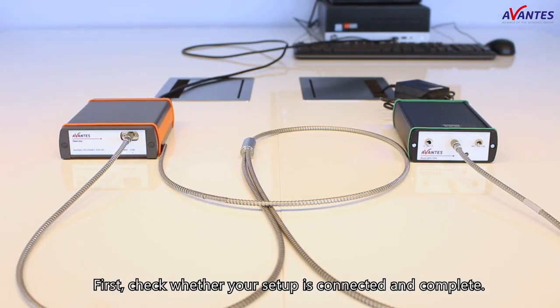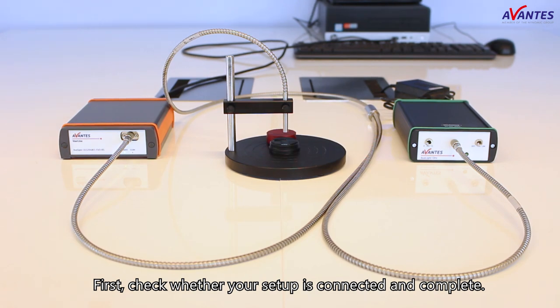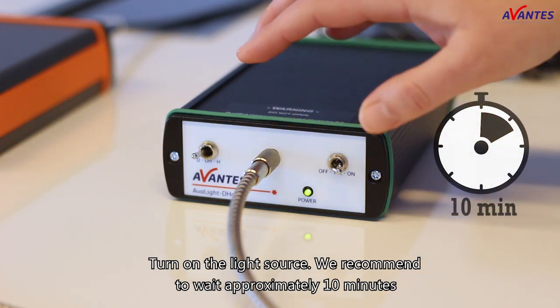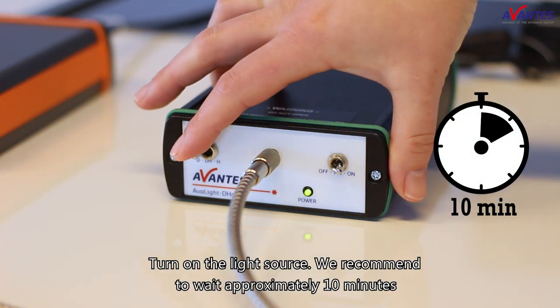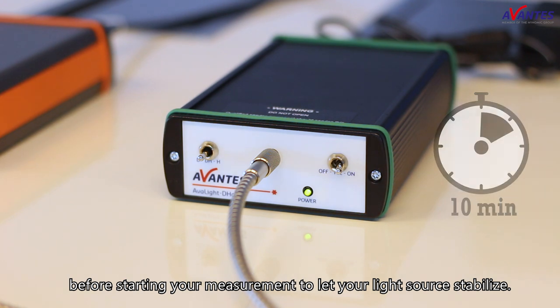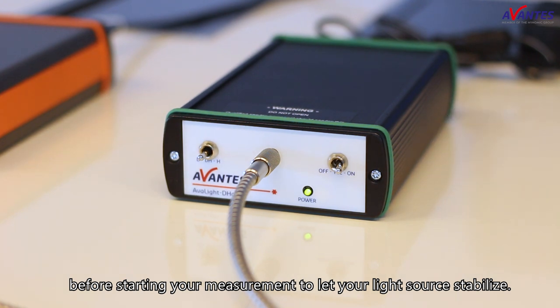First, check whether your setup is connected and complete. Turn on the light source. We recommend waiting approximately 10 minutes before starting your measurement to let your light source stabilize.